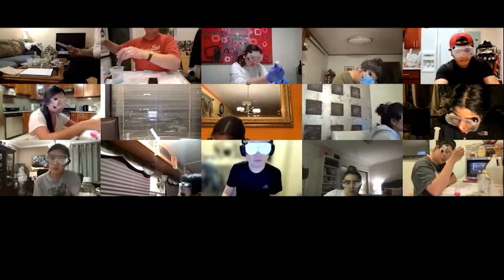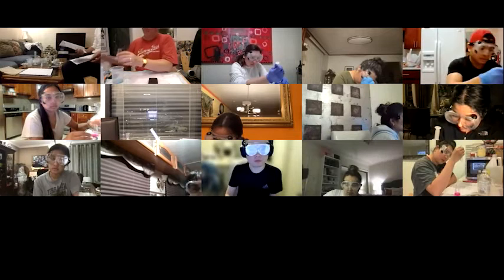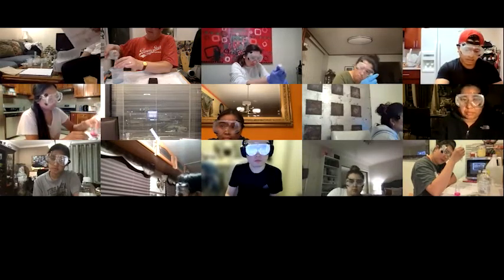Yeah, basically, if it changes with one drop, that's good, even if it looks dark.